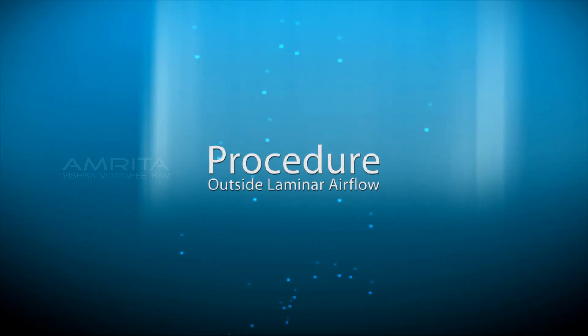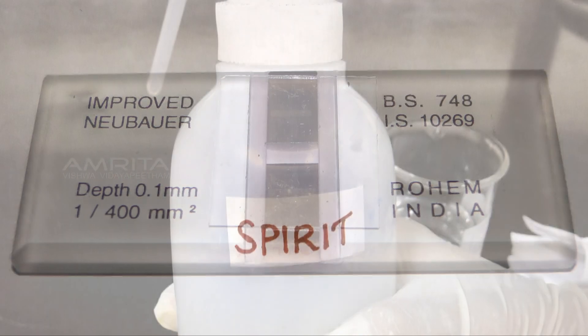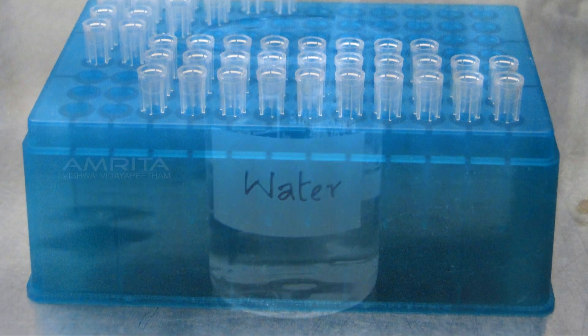Now the procedure outside the laminar airflow. Materials required for the procedure: hemocytometer plus a supply of cover slip, spirit, tissue paper, micro pipette, pipette tip box, and glass beaker with water.